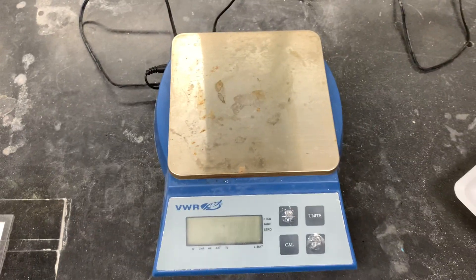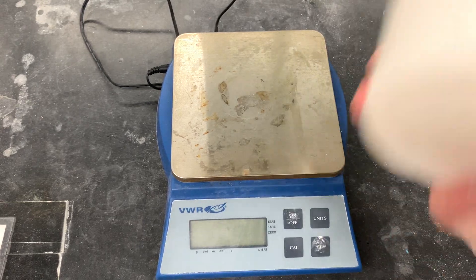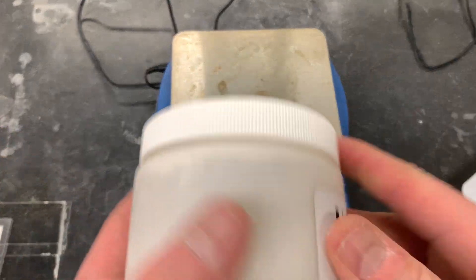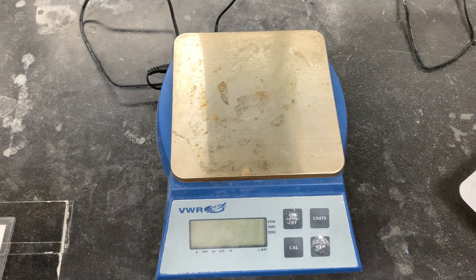When you go to collect your unknown, one of the things that you want to do is get the container that has your unknown and shake it up a lot. The reason for that is because there are four different substances in here, and one of those, or several of them, can actually kind of sink to the bottom.